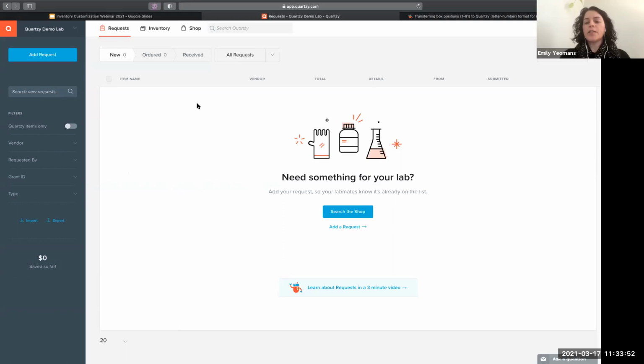Yeah, and I can send out additional information with the recording after this webinar later today or tomorrow that has the barcoding information that we do have. Like Katie said, we have limited barcode functionality right now. It's a very popular request to have that adding, subtracting feature, and it's something we talk about a lot. I think our product team really wants to get that implemented in the right way. So it's taking a little bit of time, but I'll send out what we do have right now.